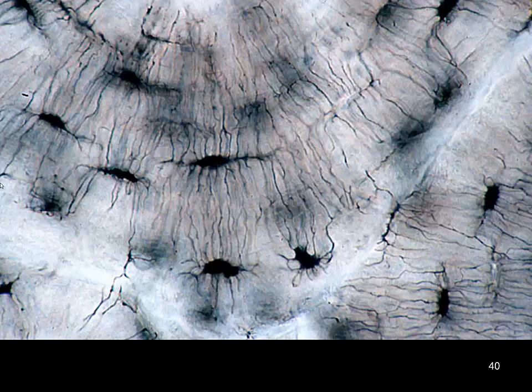Here we have a nice higher magnification view, osteocyte and all of the canalicular processes extending away from this cell. Here we have processes extending to and from these two. Here we have processes that are going to be extending forward to the next cell, this one extending forward. And so all of these are the canaliculi, and these are the nuclei and the cell bodies of our osteocytes.